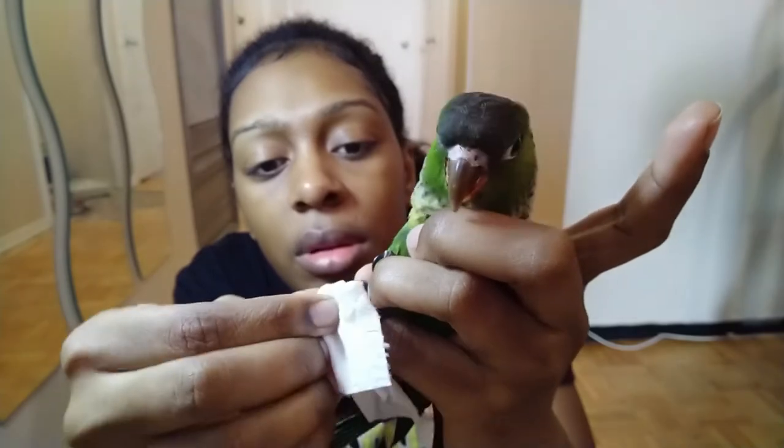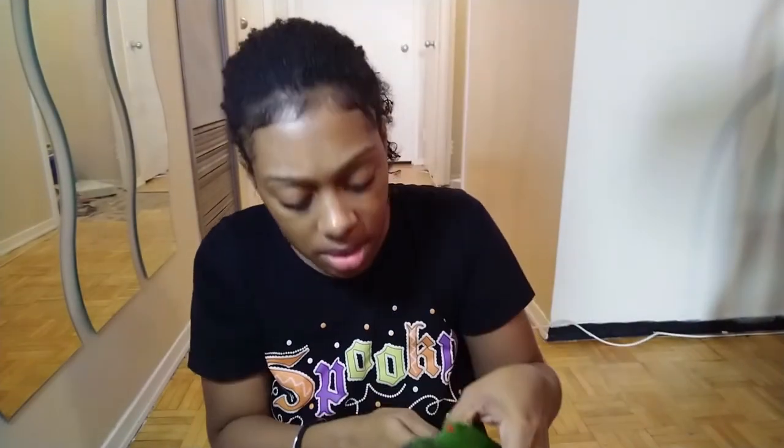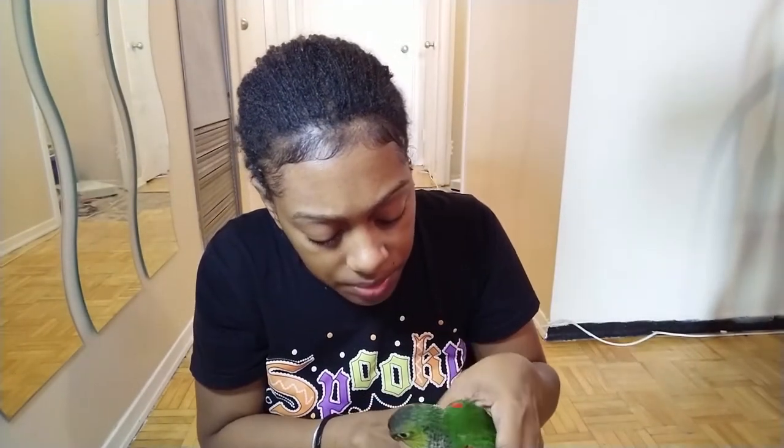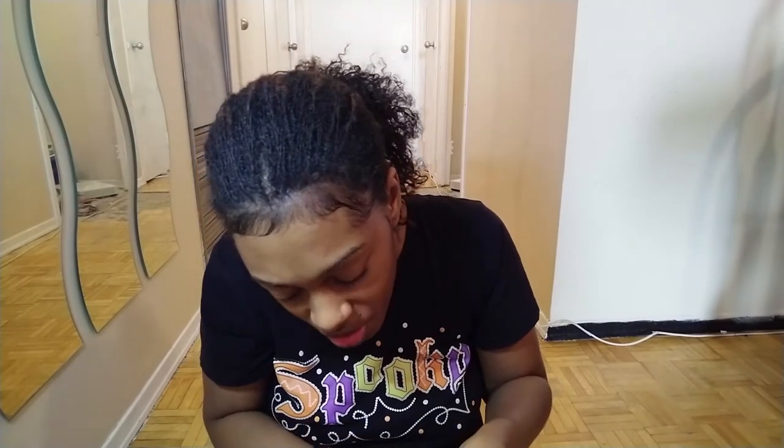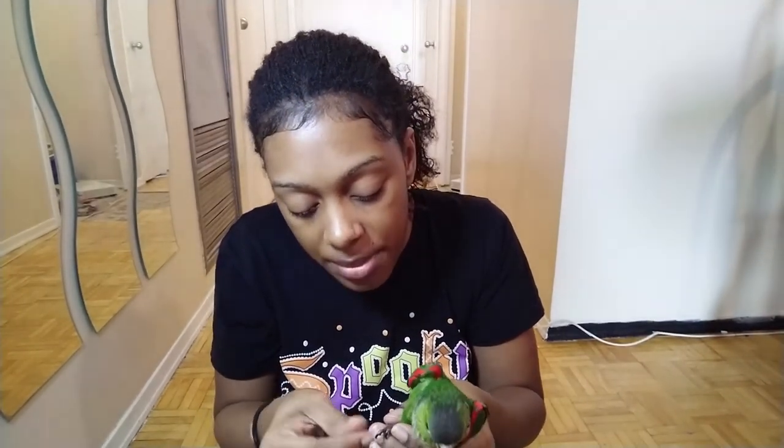I'm just going to take this first nail. Can I see that? I'm just going to rub it with the alcohol swab. I've only clipped his nails once since he was born and I haven't clipped them again. So I'm going to clip all the other nails because he does actually need a nail trim.